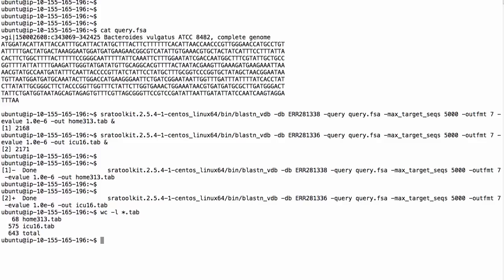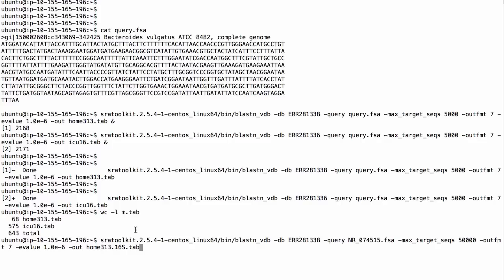This looks like an interesting result about antibiotic resistance, but I'd call it preliminary — there are any number of caveats. One is that I might need to adjust for different sizes of the search sets; I checked and they are both about the same size. Another question is whether we're simply looking at the amount of Bacteroides in the sample. To check that, I'm going to run another search against the 16S sequence — since I know there are lots of matches, I'm setting max target sequences to 50,000 for this search.